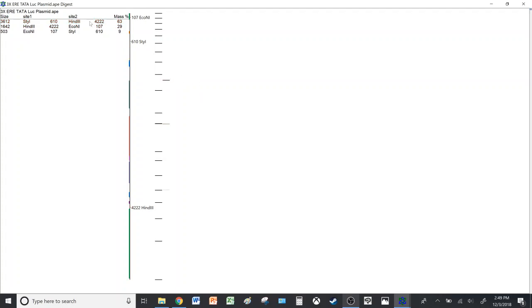This shows you the prediction of a restriction digest on an agarose gel after you run a restriction digest on a gel electrophoresis, or after you run an electrophoresis, sorry.